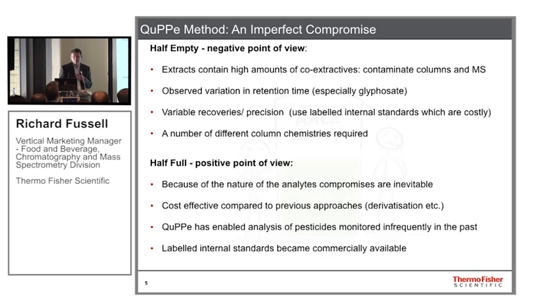So those are the negative points of view, but I would prefer to take the half full, positive view, because I think that because of the nature of these kinds of compounds, compromises are almost inevitable. It's just a fact of life, I guess. And I think that having a generic method, even though it's not perfect, is still more cost-effective compared to previous approaches, which needed derivatization.